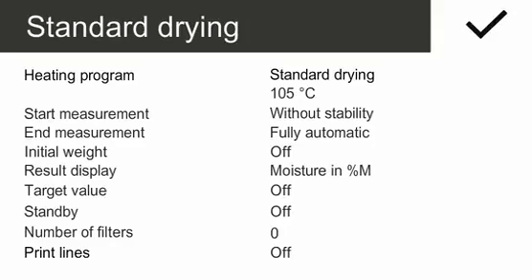In this quick guide, you will be guided through the moisture determination of a pasty sample, such as ketchup.